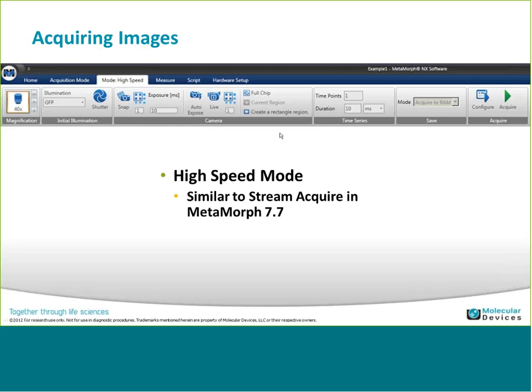So if it's 90 degrees or 180 degrees to your stage, you can now, through the calibration process, map the laser position to your field of view. So you have to do that before you can do any acquisitions. And I'll show you what that dialog looks like. I can't really do an acquisition with this in a demo mode because you do need real images and real feedback from those images in order to do the calibration and the pulse acquisition type.